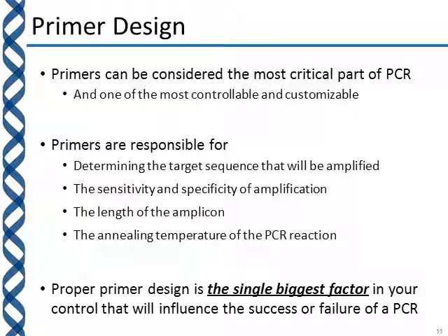And so fortunately, primers are one of the most controllable and customizable parameters that you have control over. And so I always like to highlight for my students that proper primer design is the single biggest factor in your control.